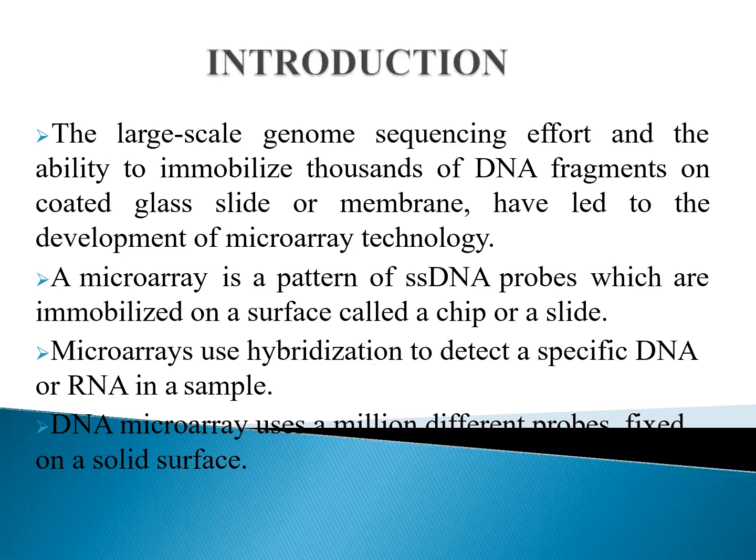So in DNA microarray, single-stranded DNA fragments are coated, immobilized on a very small surface of a glass slide, which is called a chip or a slide. Now the single-stranded DNA molecules that are coated on the glass slide are called probes.